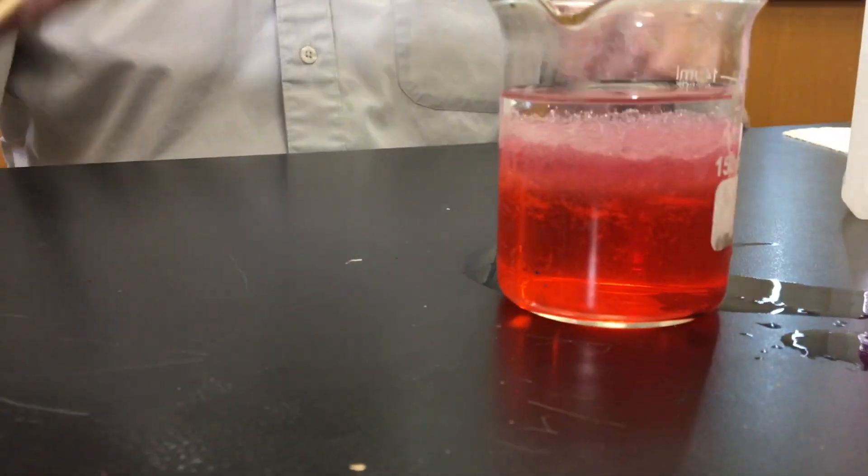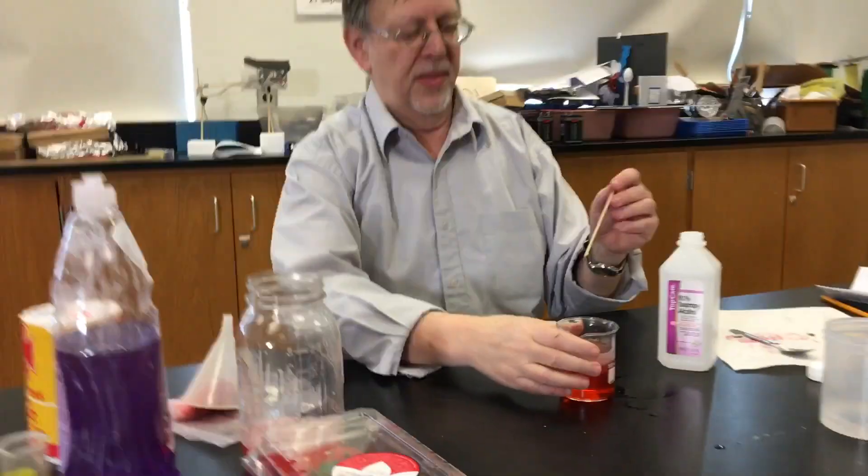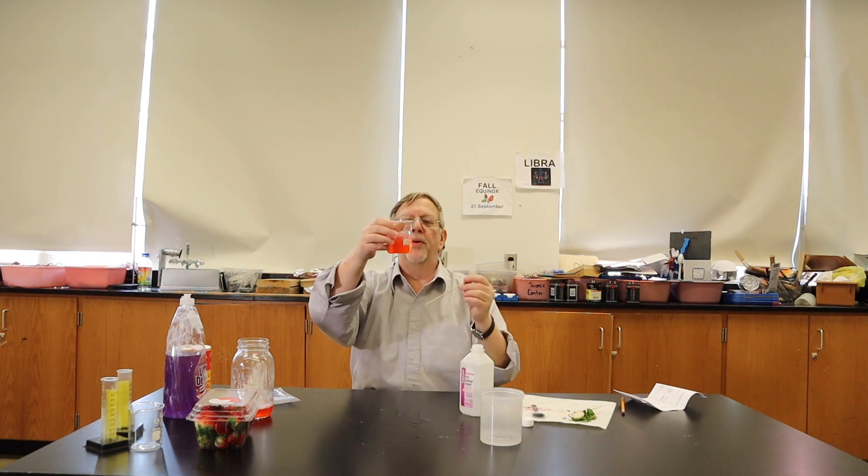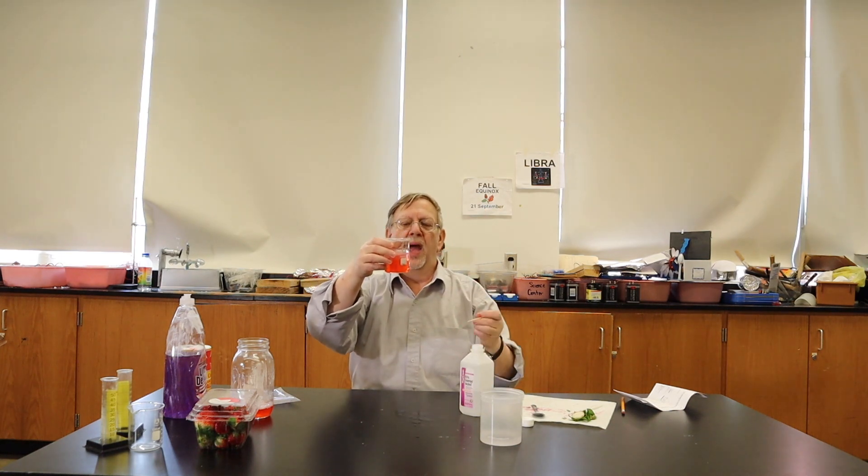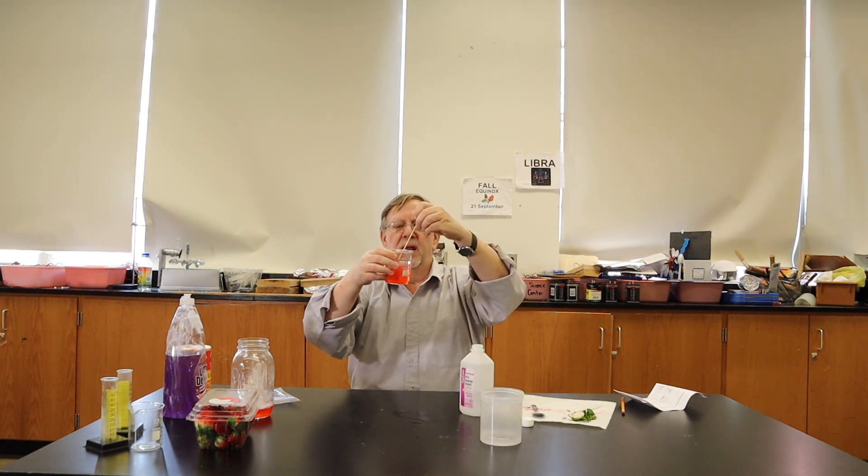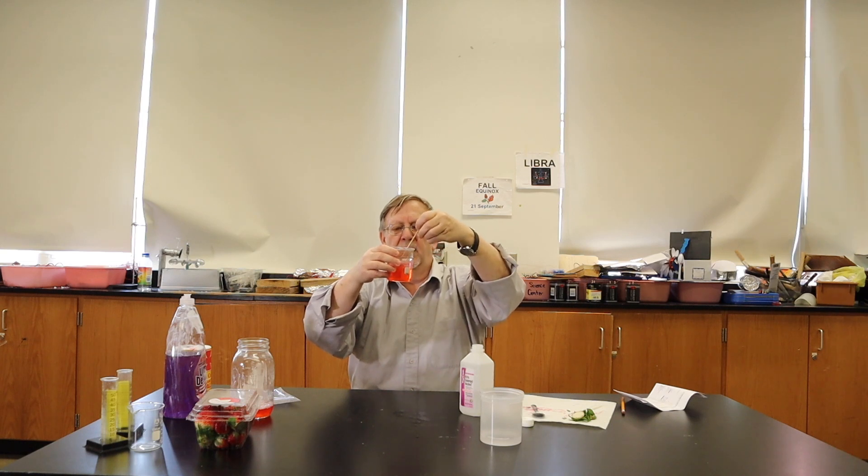With a stick, alcohol is on top, strawberries down at the bottom. And in the middle there is DNA. So we try to get some of this DNA out by twirling the stick around.